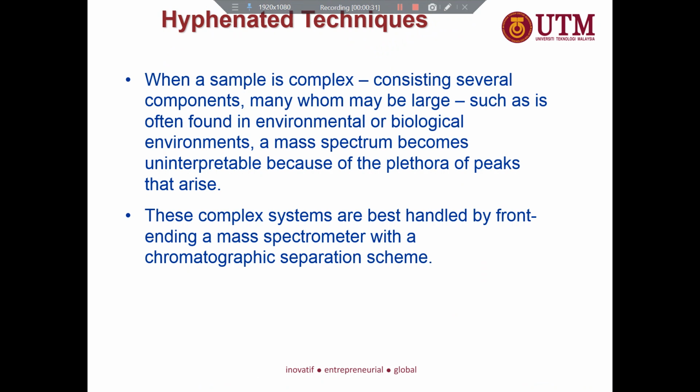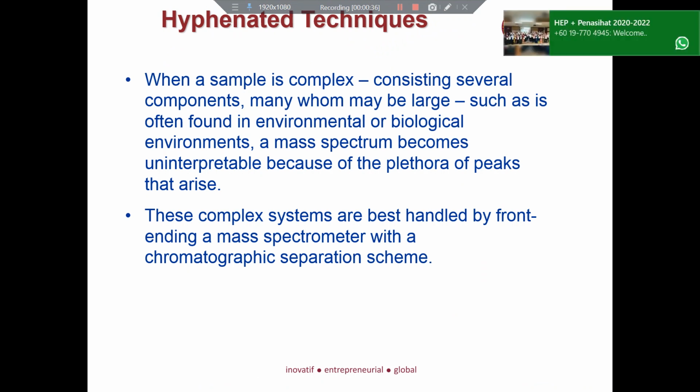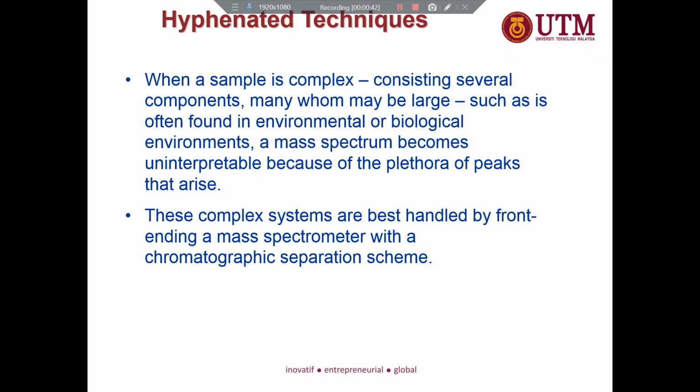You cannot determine whether this really comes from my sample, or whether it is the same as the standard or not. So you need to confirm, because we know that in our surroundings it is not impossible for compounds that we are not interested in to have the same retention time and somehow overlap with our analyte of interest. So to ensure that the analysis is confirmed, that's why we need the hyphenated techniques.